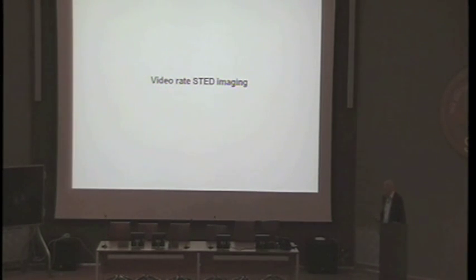I'd like to give you some examples. I said there is an inherent trade-off between speed and resolution. That's fundamental because it's on-off. And the things that are turned off, they cannot give signals.